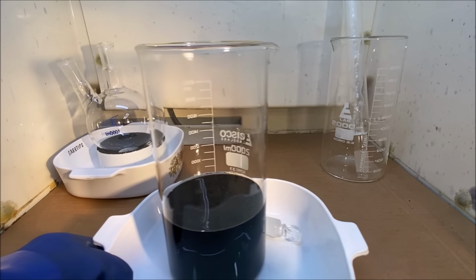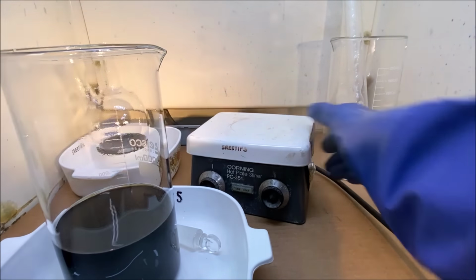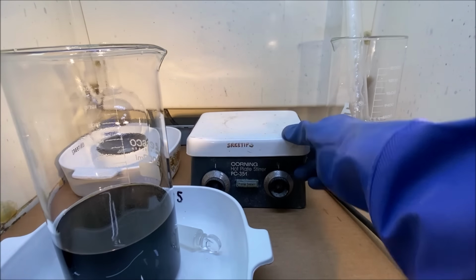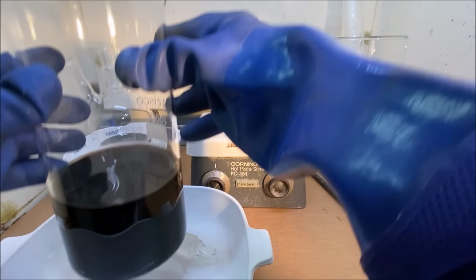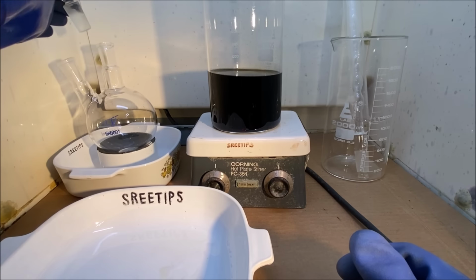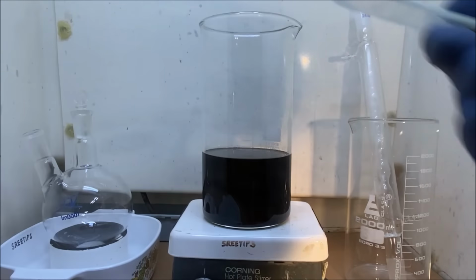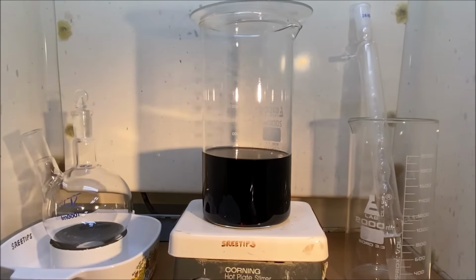We're going to reinsert our stir plate in here. Set our beaker up on the stir plate. I'm going to cover this up. I'm going to turn the stir bar back on. And I'm going to add some heat.